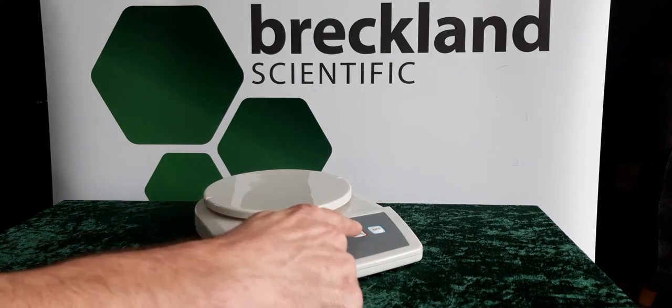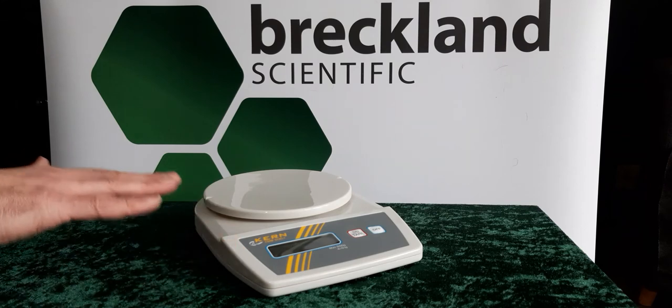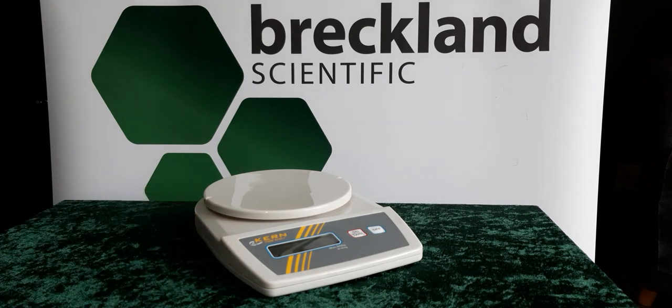The tear function facilitates formulation work. You'll notice there's a particularly flat design to this balance. Secure and non-slip positioning includes rubber feet.